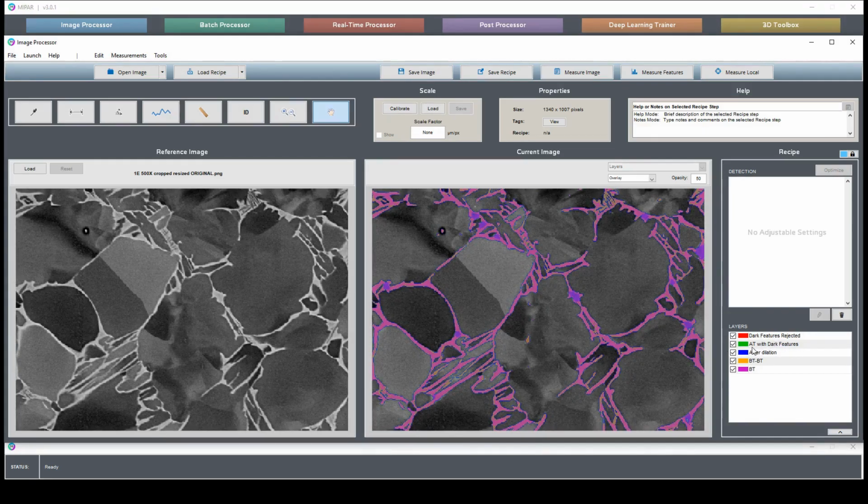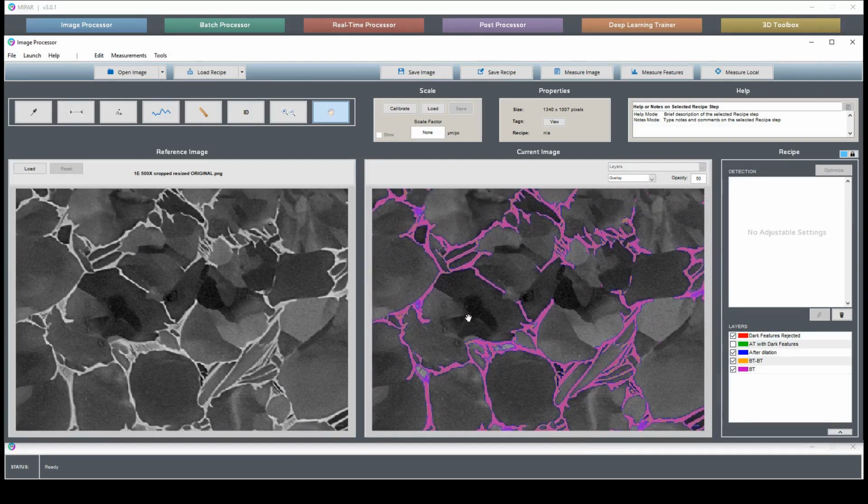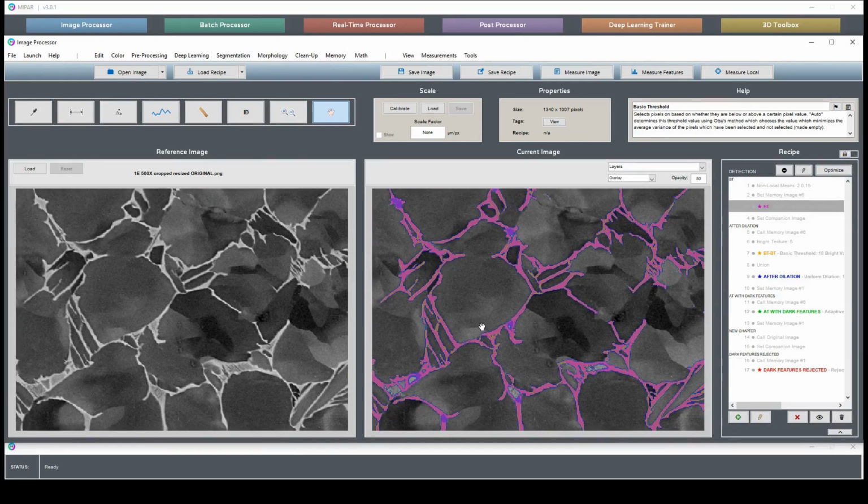Then we've got our adaptive threshold here. Okay. So I don't really see anything that we can remove from this recipe to make it more efficient. But you might have, in the course of building a more complicated recipe, say you're up at 30, 40 steps and you've been working for half an hour on it, and there's some work that gets duplicated. But for our purposes, we'll be happy with what we have.